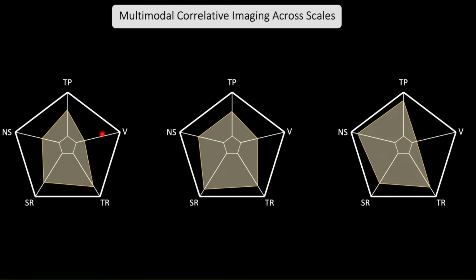I would say you get less of a three-dimensional representation than with the replicas. Throughput, though, is much higher. If you image live, it's way closer to the native state. The cells are alive and kicking, but you lose a little bit on spatial resolution, and you may gain something in temporal resolution. Maybe yes, maybe no. That's debatable.